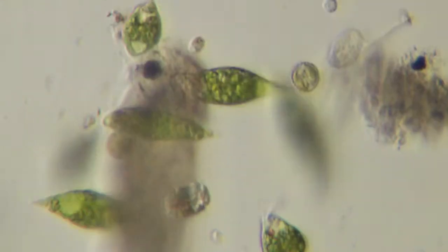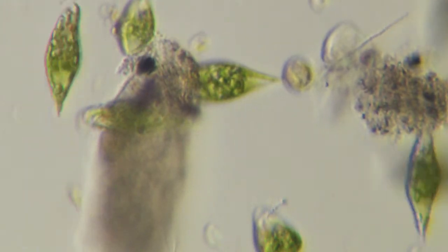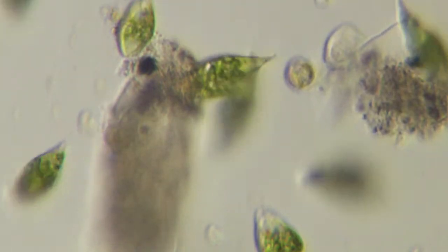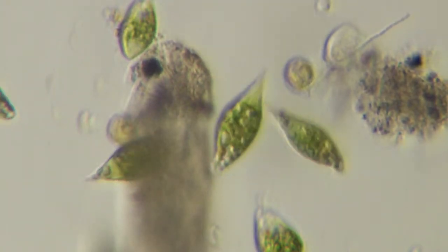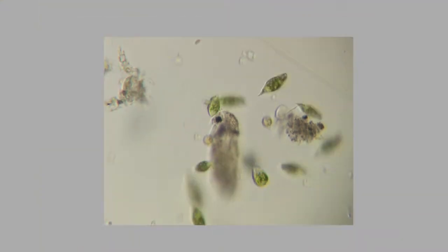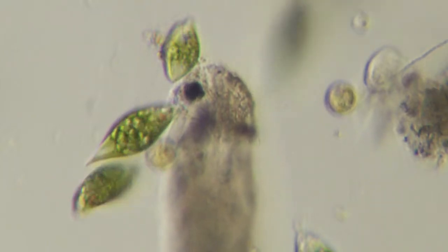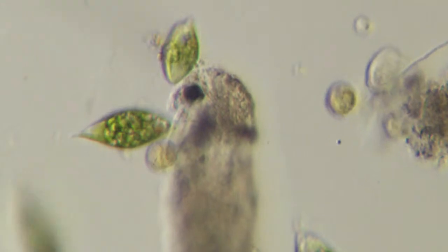Let's go up here where they're really hanging out. There's one just hanging out with all the structures there. Really nice. So occasionally you get lucky, they'll just park, maybe twist around in place, and the focus will stay the same. I can zoom out real quick and you can see how many there are in this little area. There are tons. Not too far out. So this is where I can be lazy, just kind of hang out and watch. It's like bird watching, the birds come to you.